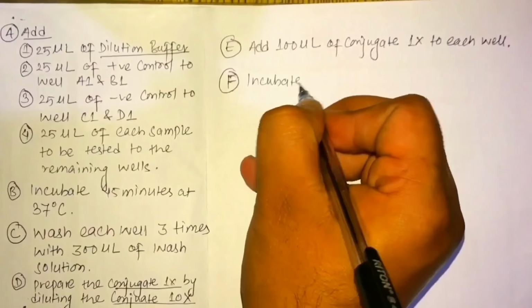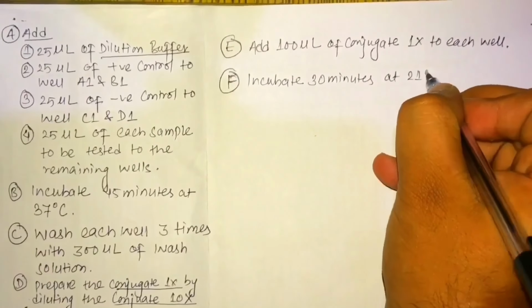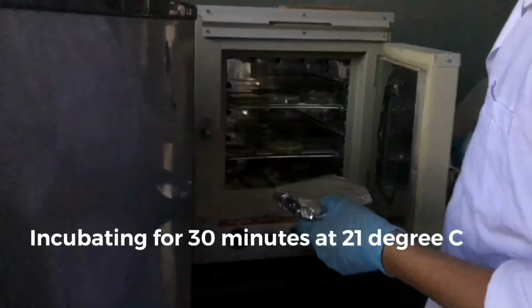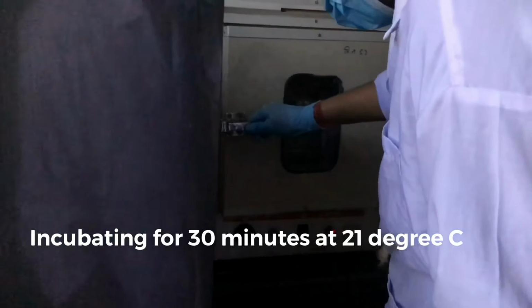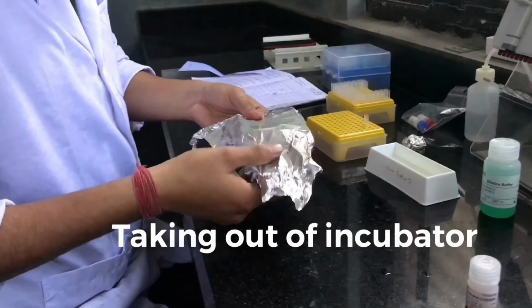Now we will incubate this for 30 minutes at a temperature of 21 degrees Celsius. So let's put it inside the incubator for 30 minutes at 21 degrees Celsius. Now taking it out from the incubator.